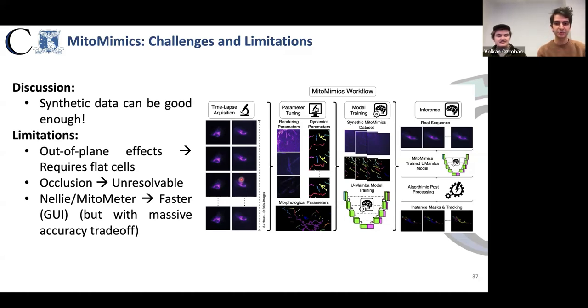However, the data sets which are not perfectly clean, so like the data sets we showed over long several hours sub-second imaging on a low-cost imaging modality, there is going to be massive accuracy trade-offs in performance in these tools, as these other segmentation workflows are purely traditional image processing algorithmic workflows.